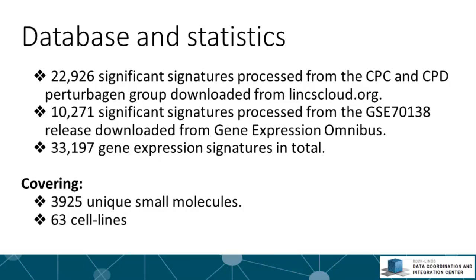There are 22,926 signatures that we deemed significant from the CPC and CPD perturbogen batches from lincscloud.org. We also added a new set of perturbations published on the Gene Expression Omnibus recently. In total we have about 33,197 gene expression signatures.